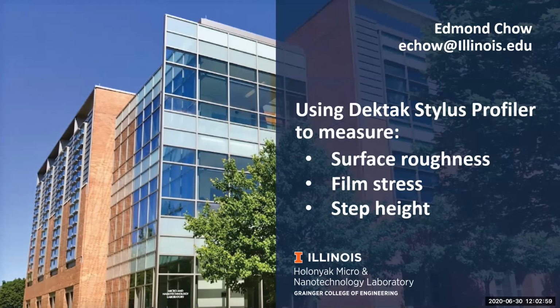live demonstration. Dr. Chow has been with us for quite a few years. He is a senior research engineer, and he's an excellent person. If you have any questions about our metrology tools or e-beam lithography.